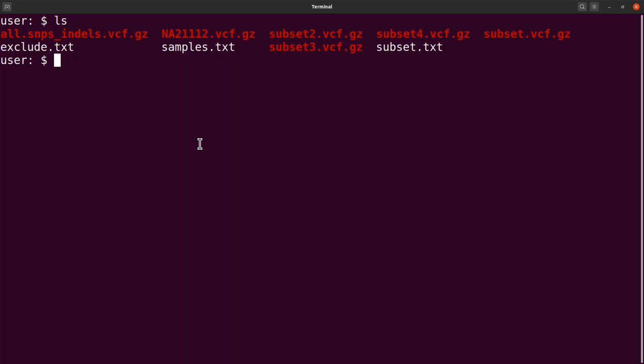So first of all, let's look at how we can call the plugins. To call a BCFTOOLS plugin, we need to add a prefix to it. Because we are using the split plugin, I'll show you how to call it. We say bcftools +split. There are other ways to call them, but we will use this one for the meantime because we just want to make it very simple. So this is how we call it.